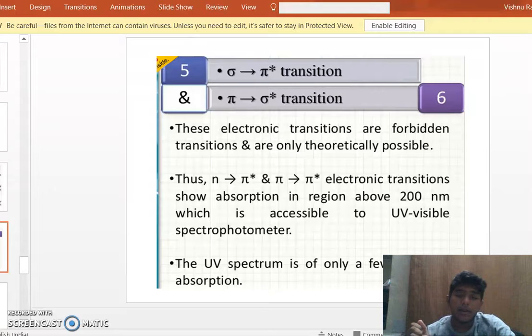From that graph we can calculate the absorption coefficient. Then there's another graph called the Tauc plot, which is made from this absorption coefficient and shows peaks at different values, from which we can analyze where the silicon nanoclusters have been formed.